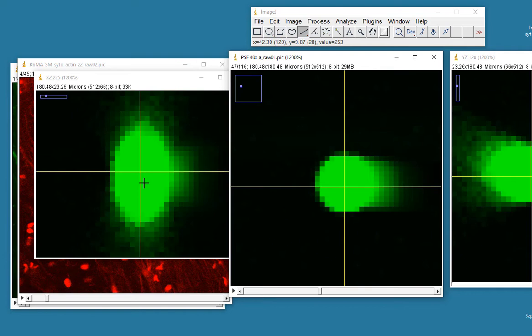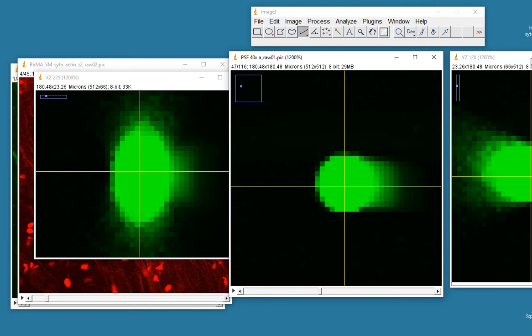So how do we correct this data? One of the characteristics that we need to know about our microscope is the point spread function, and that is the way in which light emanates from a point source. I won't go into that in any detail here because I just want to show you the practical steps that you would go through in order to create a point spread function where you don't know, where you haven't measured it in your system, but you can estimate it, how you would create that point spread function, and then how you would apply it within a deconvolution algorithm to correct a dataset.